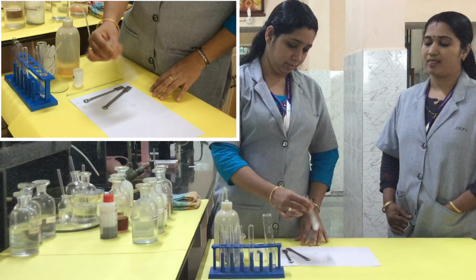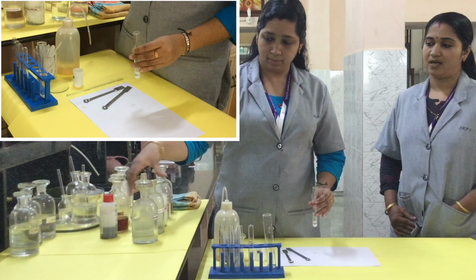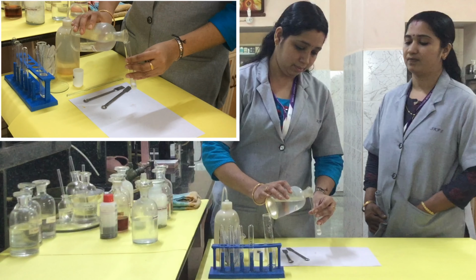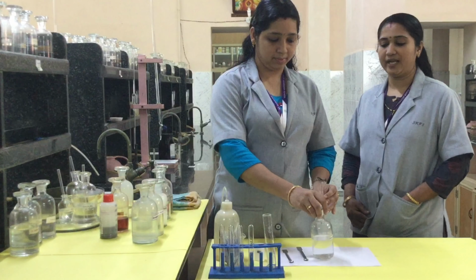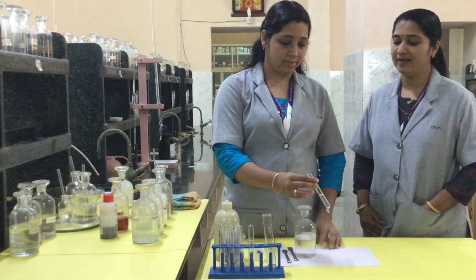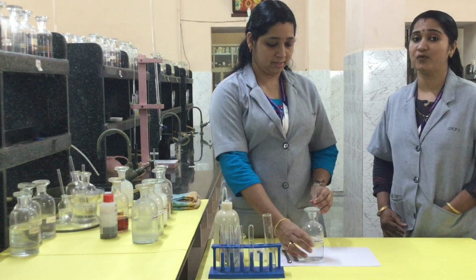Shake it well. Then add excess of ammonium hydroxide solution.